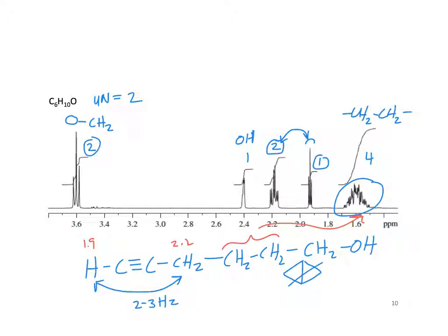Those triple bonds you don't think of that much. It would have been nice to have the IR. So you have to keep your mind open to the possibilities.